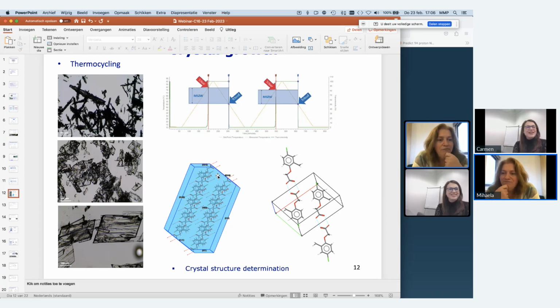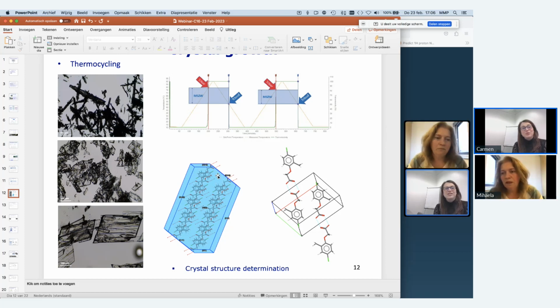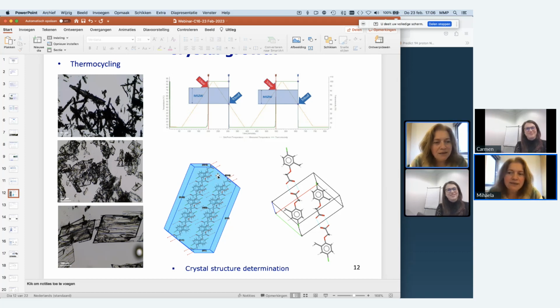What typical heating and cooling rates do you use? How sensitive is the metastable zone width to the cooling rate? Yeah, we also had, remember, Carmen, a study about that, and sometimes it may vary. Maybe that's the subject of another webinar. Well, I think 0.1 degrees per minute is what we stuck with for comparison purposes, but we saw variation in some cases, and we tried to explain scientifically what that would be. But we are still working on that. But that can also be information, huh?